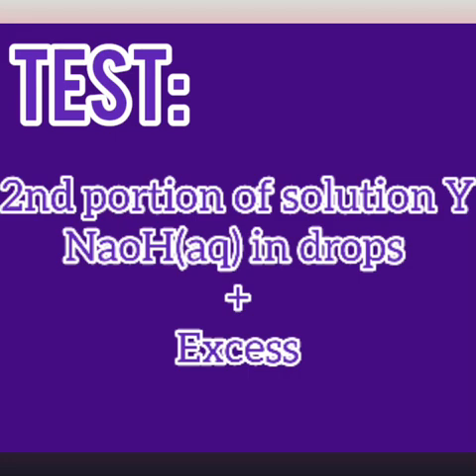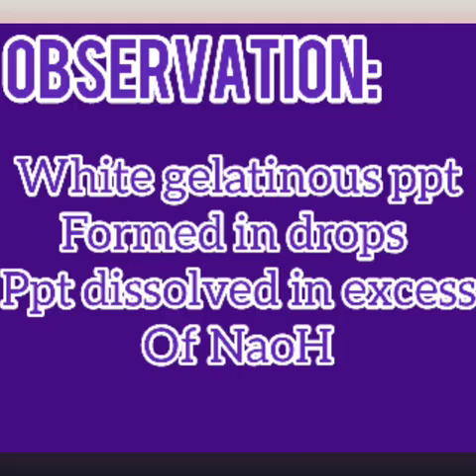Okay, now for our third test, we have the second portion of solution Y plus aqueous sodium hydroxide in drops, then in excess. So now for your observation, we have a white gelatinous precipitate formed in drops, then in excess the precipitate dissolved.